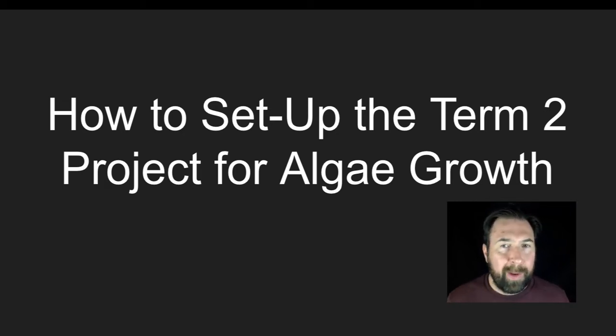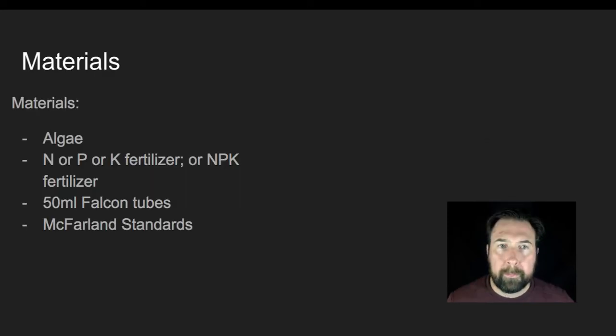I will not tell you exactly how to go about setting up this lab and how to run it, because that's actually part of the focus of the Term 2 project, is to give you a little bit of variability so that you will play around with these materials and methods and figure out how to collect data when given some key variables that you know about. All right, so here we go.